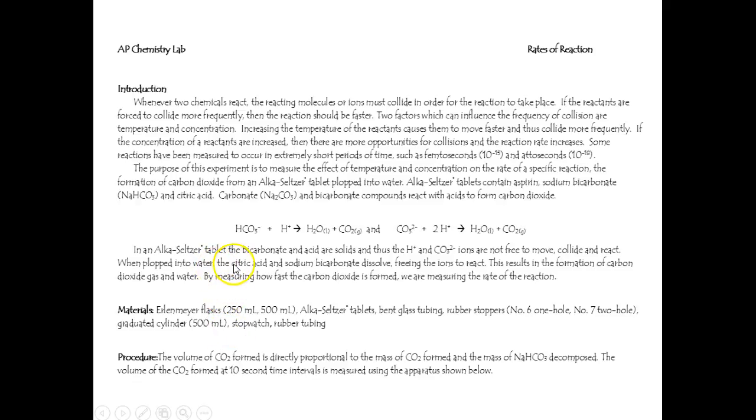In an Alka-Seltzer tablet, the bicarbonate and acid are solids, and thus the H+ and the CO3 2- are not free to move, collide, and react. I wonder if they keep them apart somehow physically. When plopped into water, the citric acid and the sodium bicarbonate dissolve, and then suddenly they can react. This results in the formation of carbon dioxide gas and water. By measuring how fast the carbon dioxide gas is formed, we can measure the rate of the reaction. Okay, that's the real key right there.